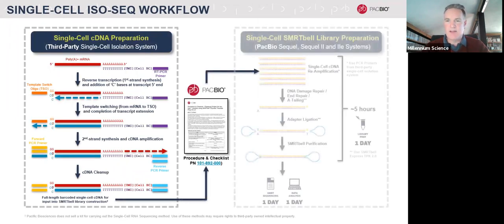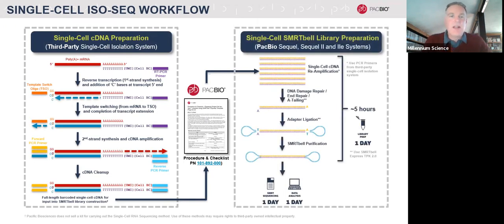Sorry about the animations, taking a little while to load. So this is really how you stitch the single cell capture part of the protocol together with the PacBio sequencing part of the protocol, through the guide that I showed you.